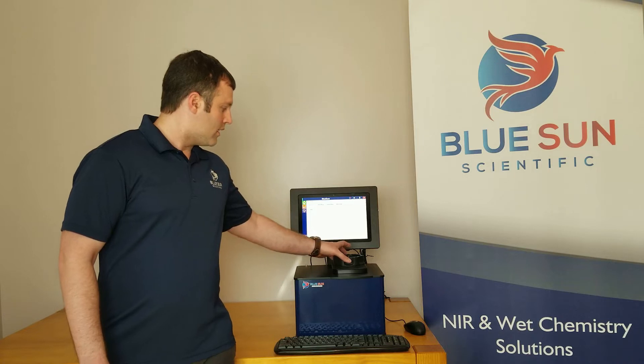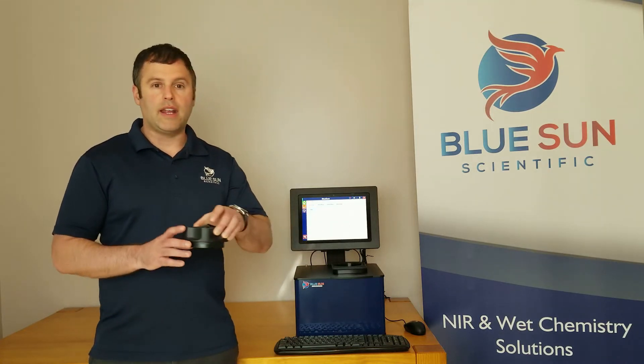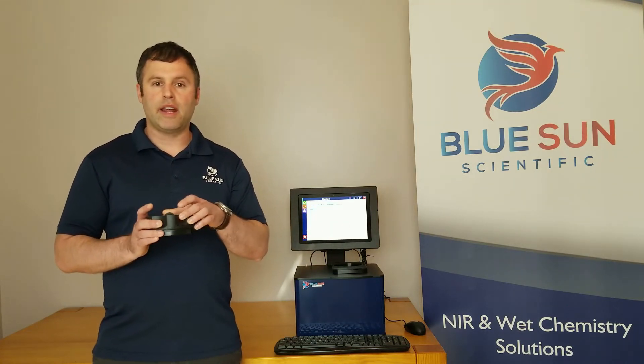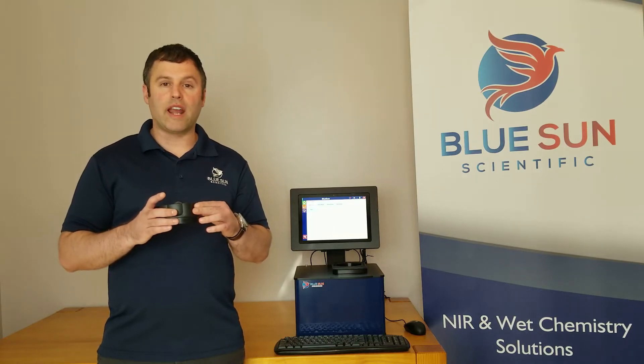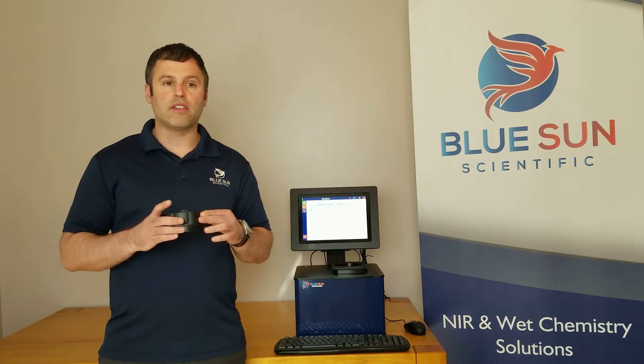Testing with the Phoenix 5000 is easy. Simply place your sample into one of the sample cups. Here I am using the large cup. The Phoenix 5000 can also scan industry standard ring cups, and the staff at Blue Sun Scientific can help design custom sampling options for unique applications.